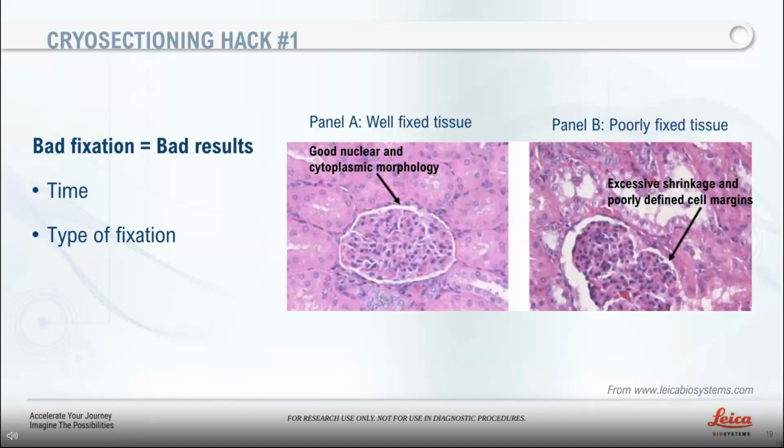And then we cannot forget the sucrose solution that I like to include as part of my fixation discussion, because after fixation, the specimen should be placed in a sucrose solution to cryoprotect your tissue during the freezing process, and prevent the loss of morphology and antigenicity.